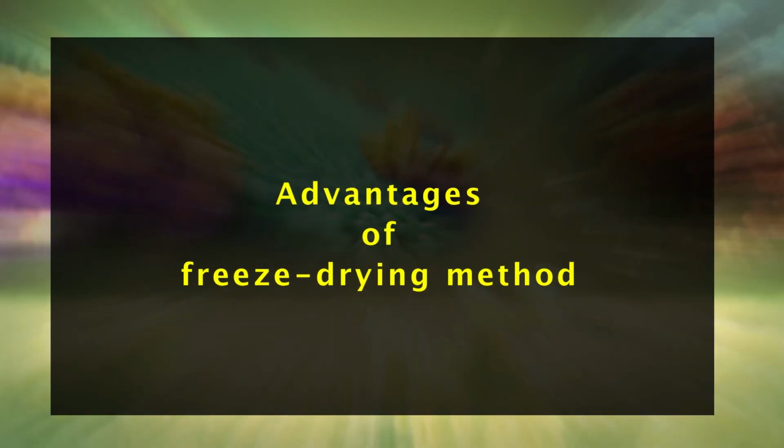Advantages of the freeze drying method: the tissue does not shrink, fixation is homogeneous throughout, soluble substances are not extracted, the chemical composition is maintained, and the structure in general is maintained with very little modification, and the fixation process is very fast.